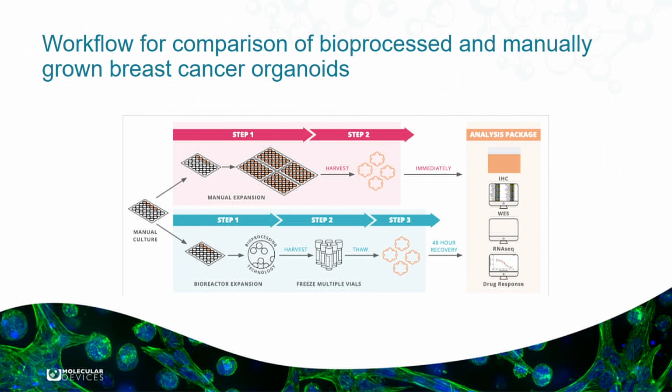We then thawed them, let them recover for 48 hours, and then comparing the manual harvest to those that have been freeze-thawed and recovered, we then put them through our analysis package, and our analysis package included immunohistochemistry, whole exome sequencing, RNA sequencing, and the drug response assay.